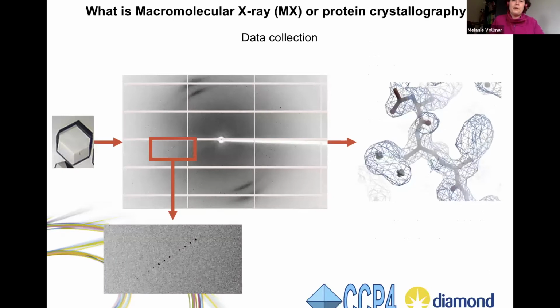And then we have protein crystallography. Lucy was working all on sequences, but she showed you some images of helices and beta strands, colorful images of a protein. The very first was her green fluorescent protein.